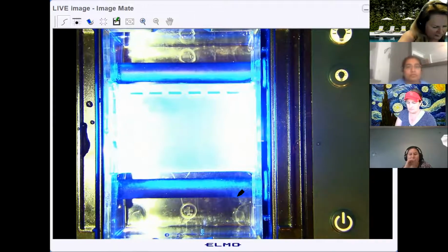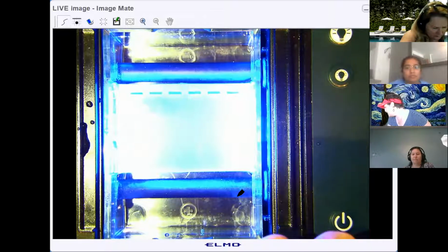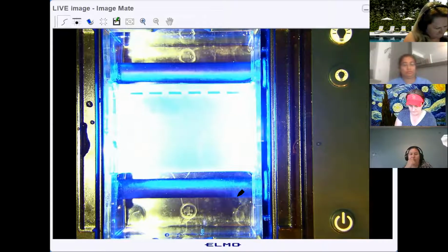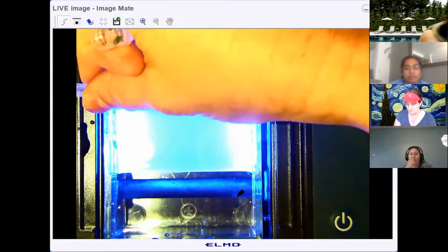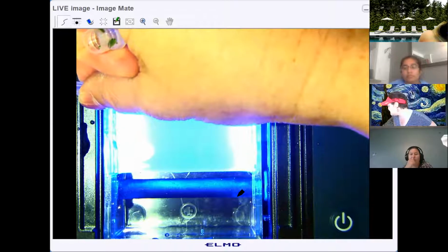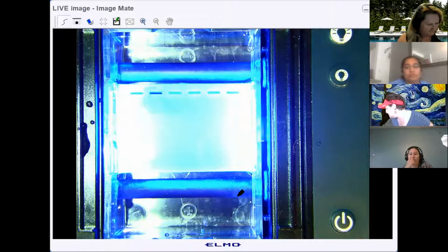That's too bad. Okay, and then in the next well, I'm going to put, where's Jillian? Here's Jillian. I did a better job with that sample.